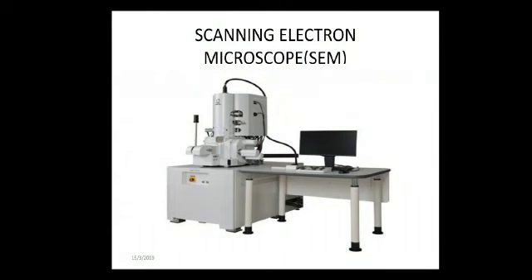So here, let's see how the instrument will work. First, the instrument has a heated filament as a source of the electron beam, and we can see the condenser lenses, evacuated chamber, electron detector, amplifier, and CRT with the image forming electron. So this is how the arrangement will be.